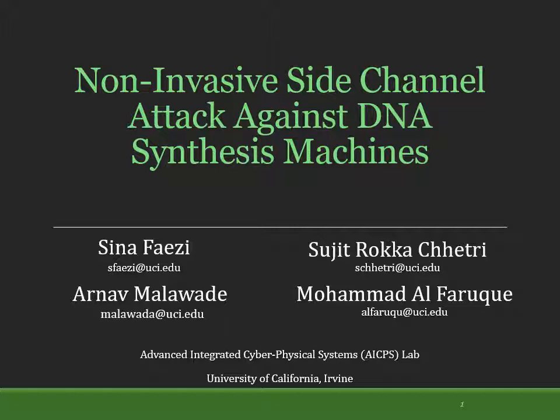In this video, I'm going to present a novel side channel attack methodology against commercially available DNA synthesizers. This work is a result of a collaboration between UC Irvine and UC Riverside, and it's supported by the National Science Foundation in an effort to manufacture secure high-throughput DNA synthesizers.